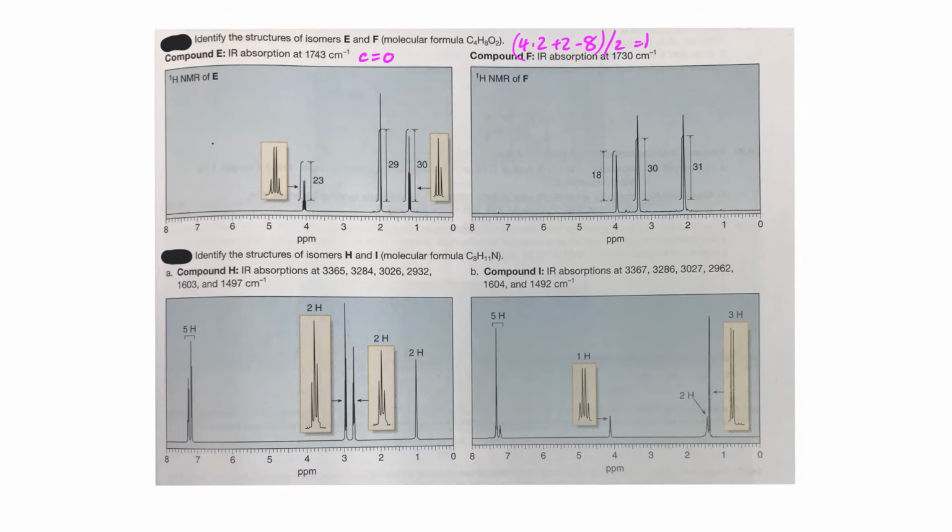And then we're going to look at the 3 signals in the proton NMR. You'll see that these 3 signals do not have integrations that look like 1 hydrogen or 2 hydrogens or 3. They're simply some numbers that the computer measures, essentially the height of this curve. This is the curve that we use calculus to derive, and that is showing us the value of the area under the peaks. You can see how these peaks have some area to them. It's actually rather slight, but they do have area. We measure that area, and that's where we get the integrations from. And so this is actually an integral curve, and you can see that this curve is a little smaller than the 2 curves at 2 or 1 ppm.